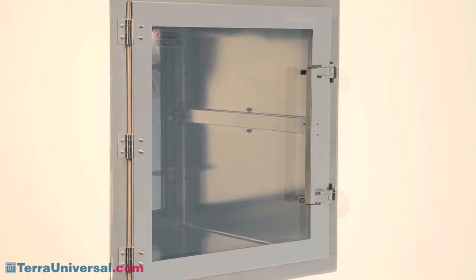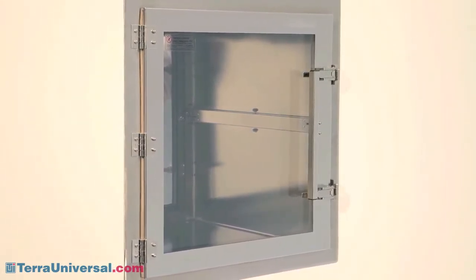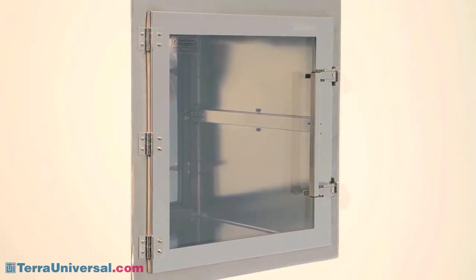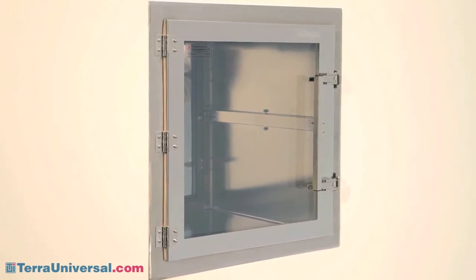Another plus to these chambers is their seamless one-piece mounting bracket and adjustable wall mounting system, which allows installation in most conventional walls in just over two minutes.